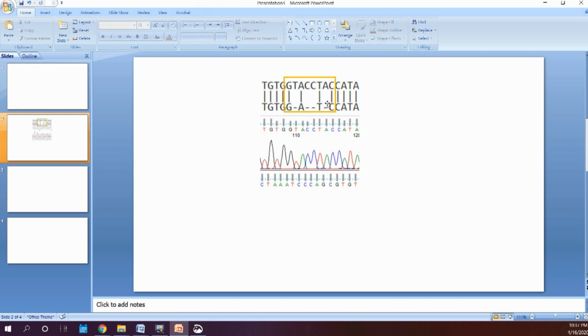So something like that to highlight this, and then you would copy, you would paste, and then maybe let's highlight the peaks. Maybe that's better. So there you go. So you would present something like this for your final figure.